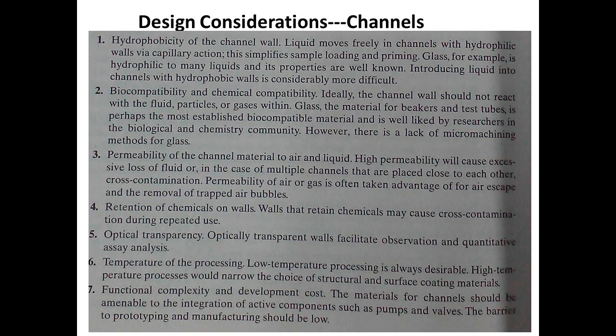Slide number 37 is about how you are going to design a channel. There are a few considerations that you have to know. There are 7 points here: hydrophobicity, biocompatibility or chemical compatibility, the permeability of the channel material to air and liquid, retention of chemicals on walls, optical transparency, temperature of the process, functional complexity and development cost.